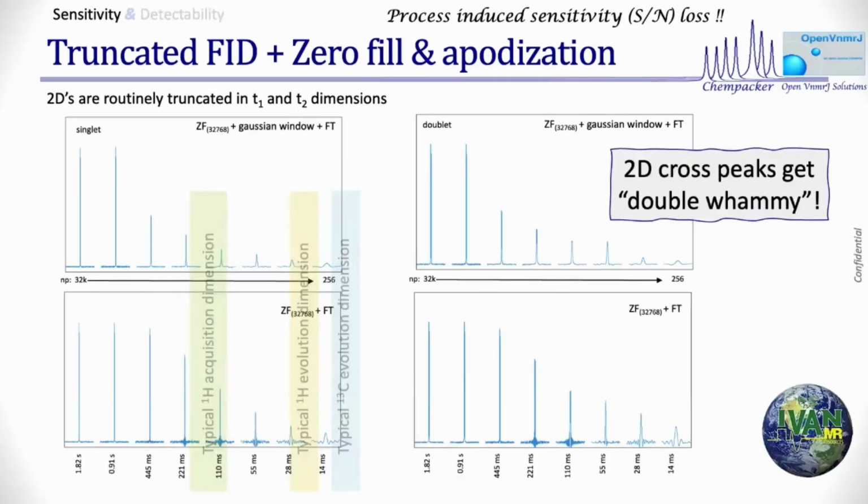We just talked about, somebody talked about probe, hot probe, cold probes. We talked about cryo probe. We spent $100,000 for a cryo probe. Go to the lab. First thing we do is carbon-13 HSQC. Shot ourselves in our foot with sensitivity.